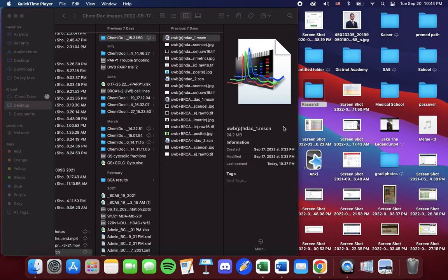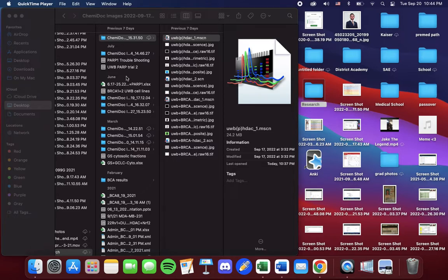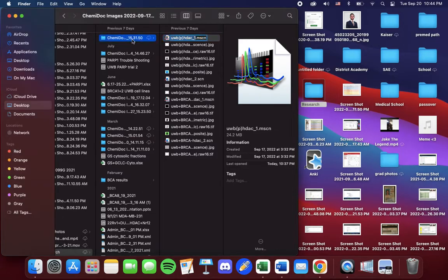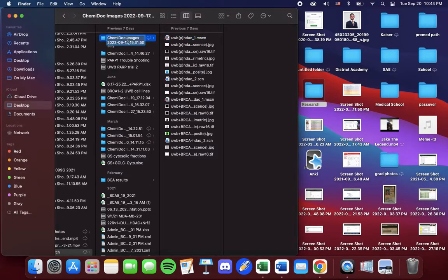I'm going to show you how to quantify western blots. So the first step after imaging is you're going to select the file that the images are saved on.